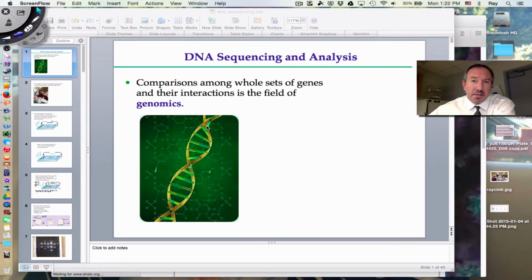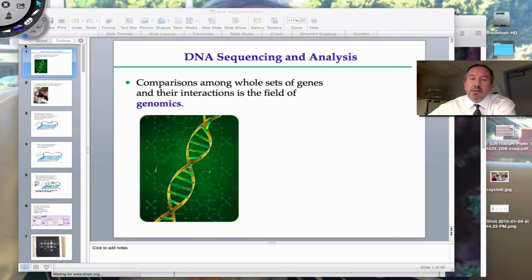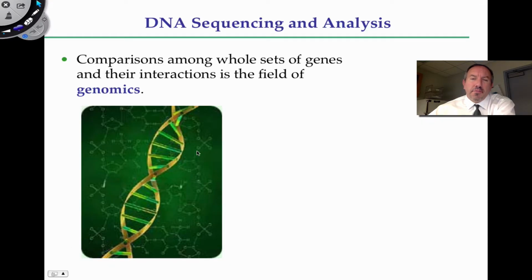DNA sequencing. That's right, when you are studying molecular genetics or molecular biology in general, one of the very first steps is to extract DNA. But one of the things that you'd want to do with the DNA is analyze it. You'd want to see what the nitrogenous base sequence is. And so you're interested in sequencing for a variety of reasons.